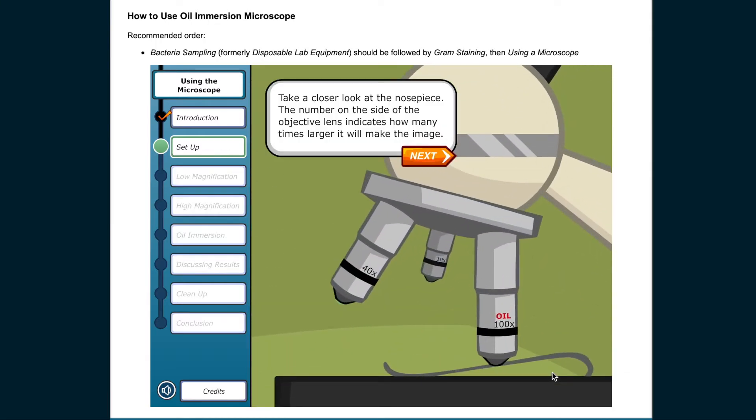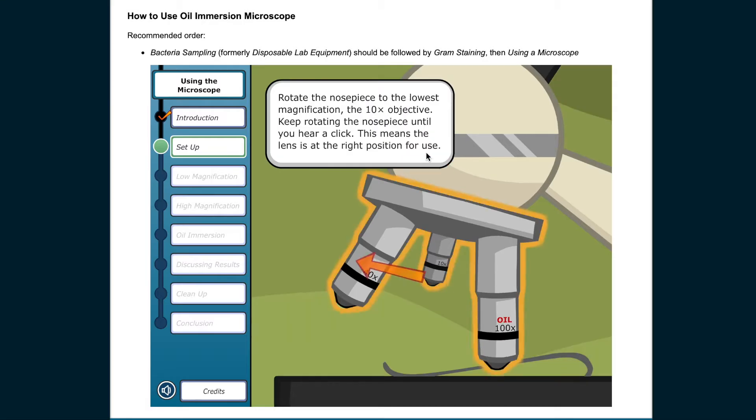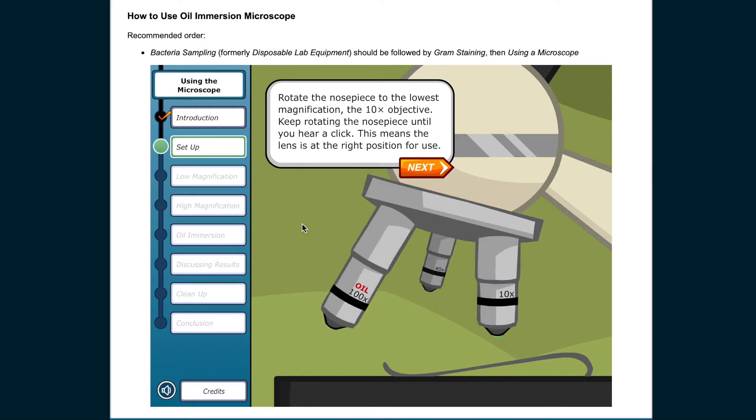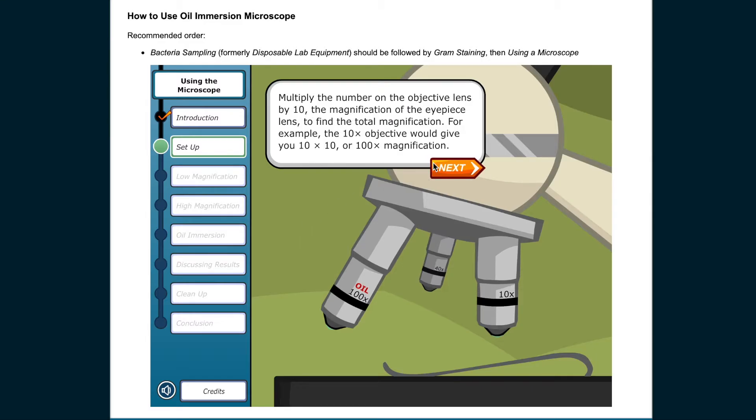Start by making sure the microscope is plugged in. Take a closer look at the nose piece. The number on the side of the objective lens indicates how many times larger it will make the image. Rotate the nose piece to the lowest magnification, the 10x objective. Keep rotating the nose piece until you hear a click. This means the lens is at the right position for use. Multiply the number on the objective lens by 10, the magnification of the eyepiece lens, to find the total magnification. For example, the 10x objective would give you 10x10, or 100x magnification.